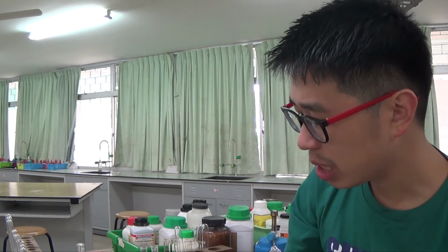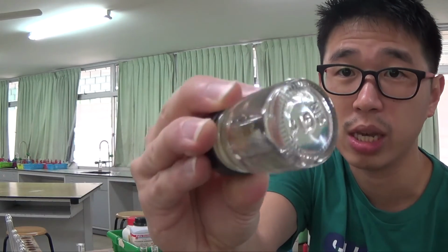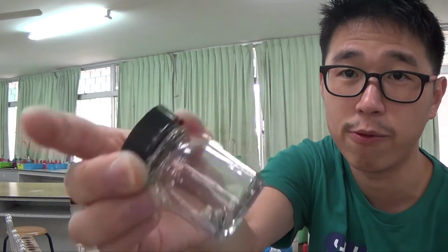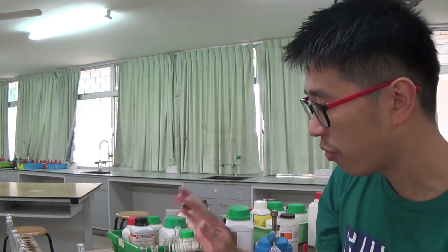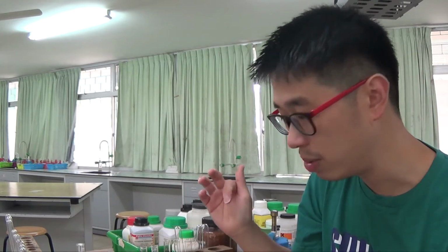You must be able to differentiate that the NH3 comes from different sources, NH4 plus as well as NO3 minus. The test for NO3 minus requires you to heat in the presence of aluminium foil. Okay, so you can watch that tutorial video. So I'm not going to test for nitrate here, but I just briefly outlined what the problem was.